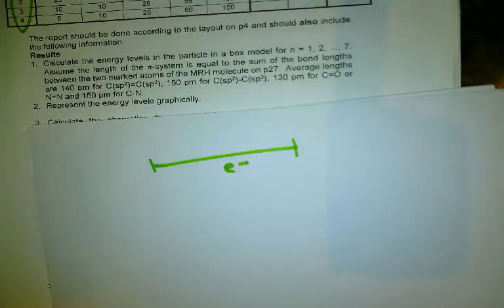Because remember, you measure absorbance using UV spectroscopy.